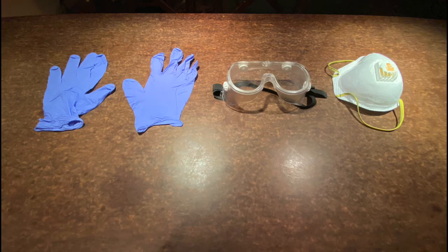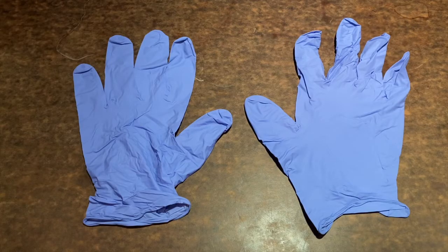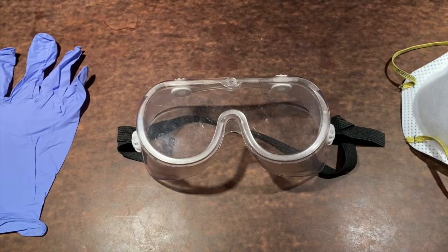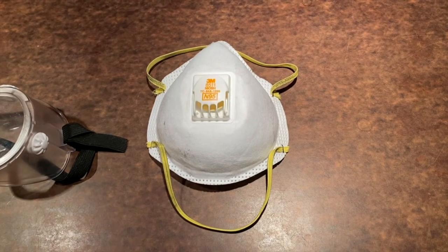Okay, so that brings us to operational safety. Whenever you're actively working with a hazardous chemical, you want to make sure you're wearing the proper personal protective equipment, or PPE, so that if things go south, you're nominally protected. The SDS tells us that hydroxide is a danger to skin and eyes, and is bad if accidentally inhaled as dust. This means we want to wear gloves rated for alkaline hydroxide, full eye protection with side shields in case of a splash, and a dust mask.